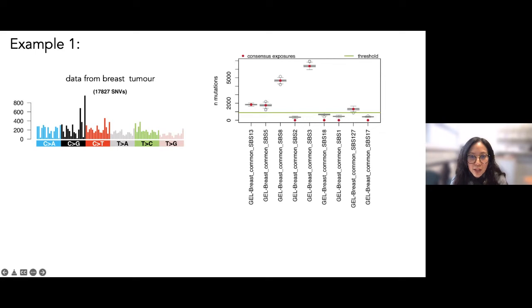And the first question that we asked was, have we assigned the right signatures for this tumor type? And the answer is yes. We've used the breast common signatures that have been identified in the Genomics England data.